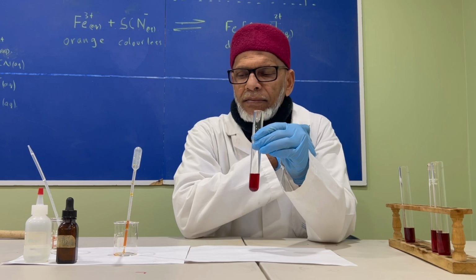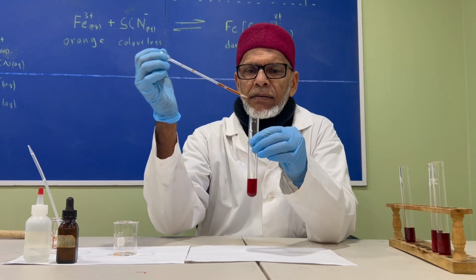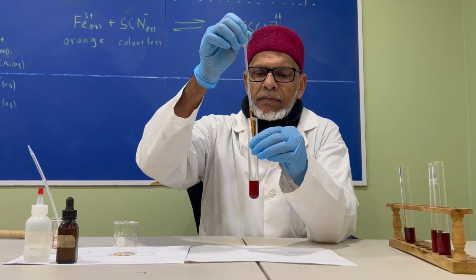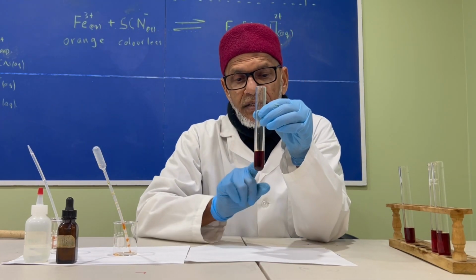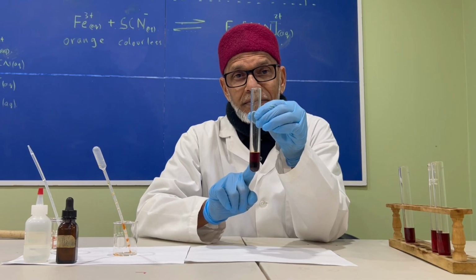Okay? All right. Here we go. This is a sample of iron inside here. Pay attention. What did you notice? You can see that this solution turned darker in color.